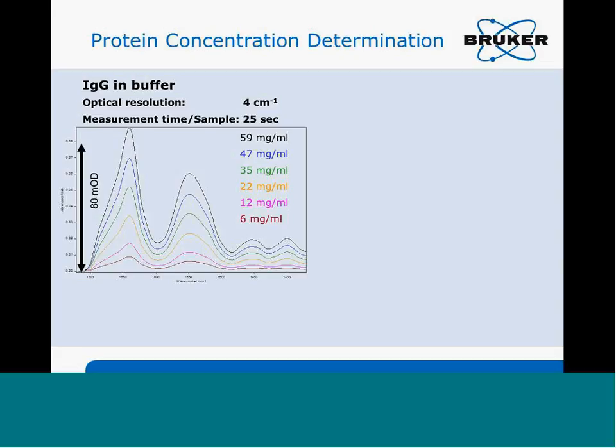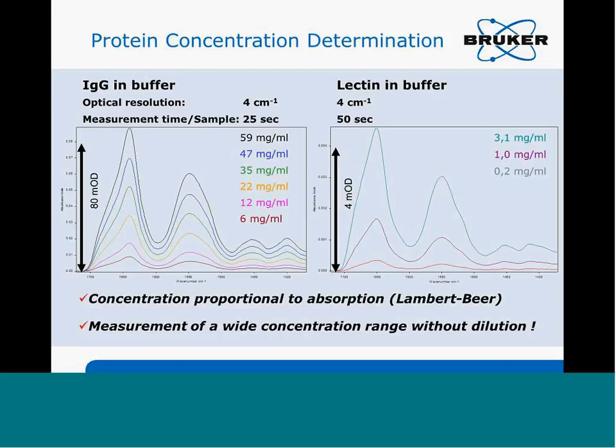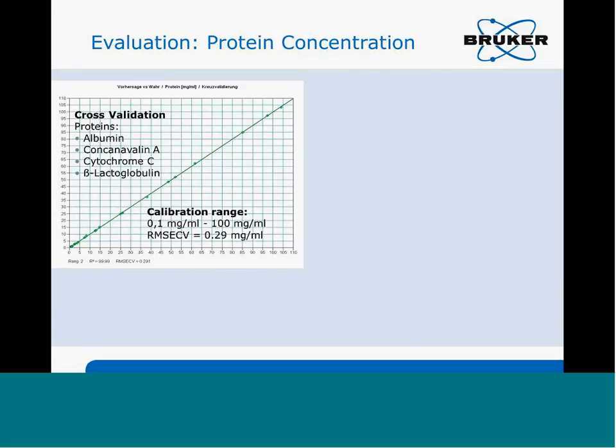One example is the concentration of proteins. That is how I can do it. So let's measure a good spectrum of proteins. With Bruker, we created a model of absorbance versus concentration for a set of samples. You can see the higher the concentration, the more absorbance. This model is based on the Lambert-Beer law. You can use this model from Bruker: after you measure the spectrum, you run this model, and then you can get the concentration of a protein.